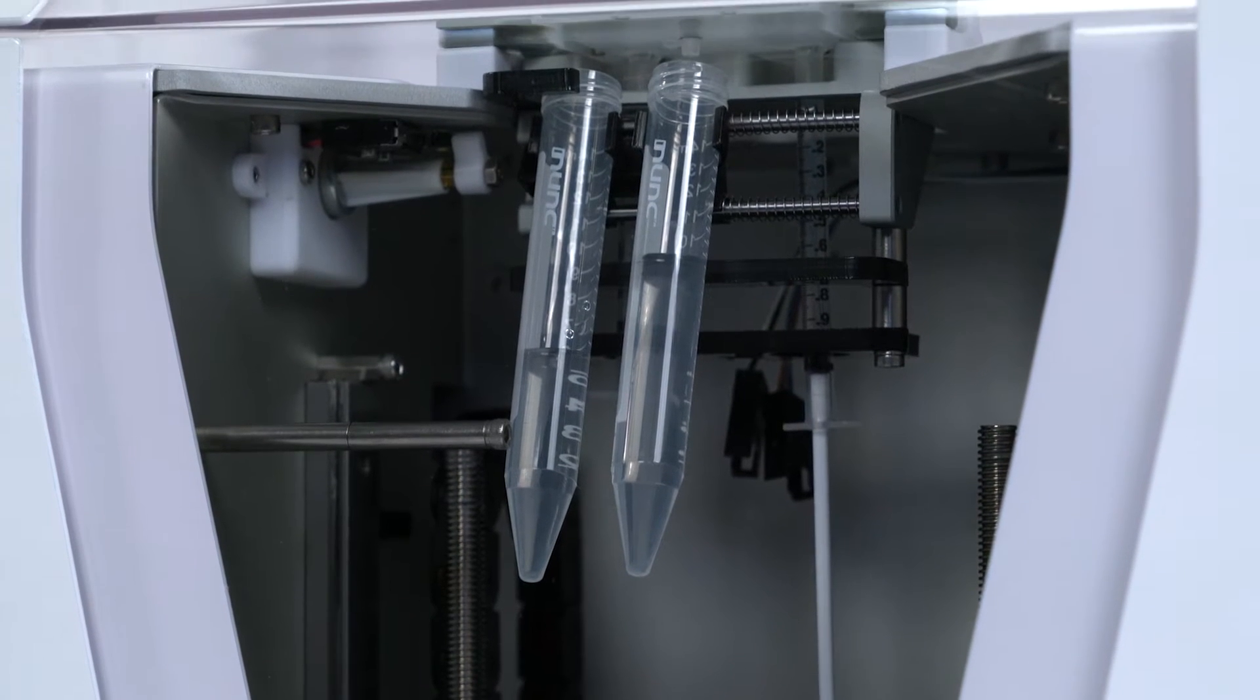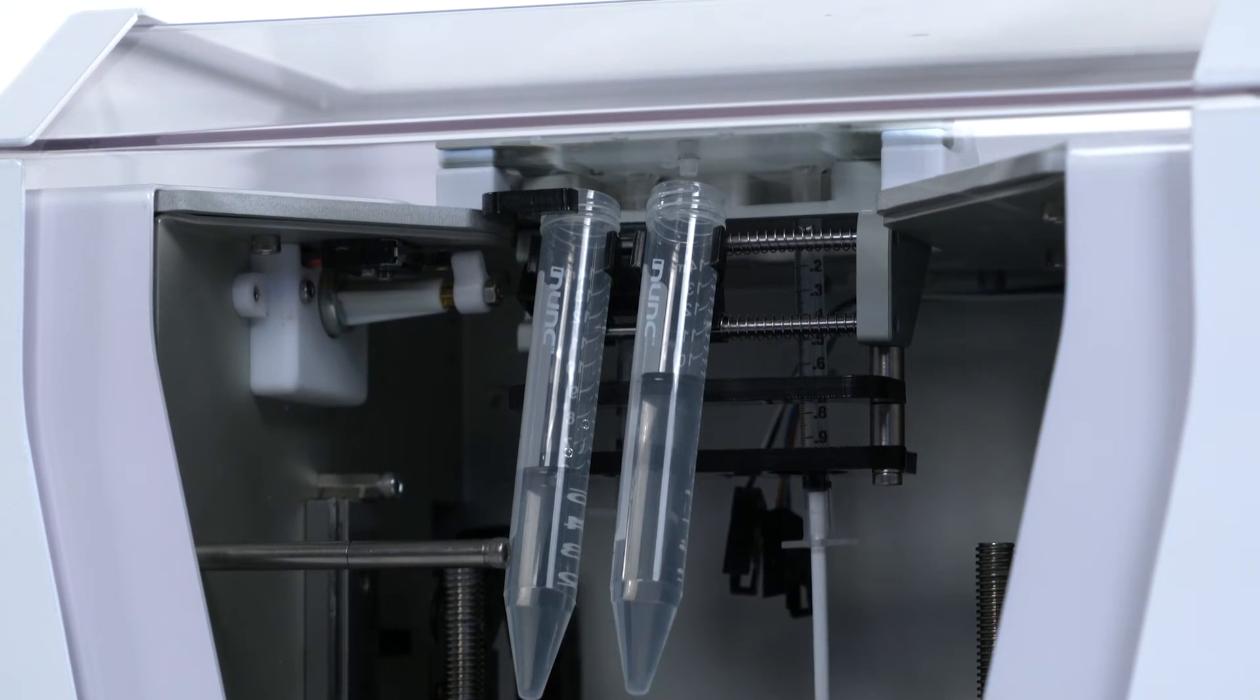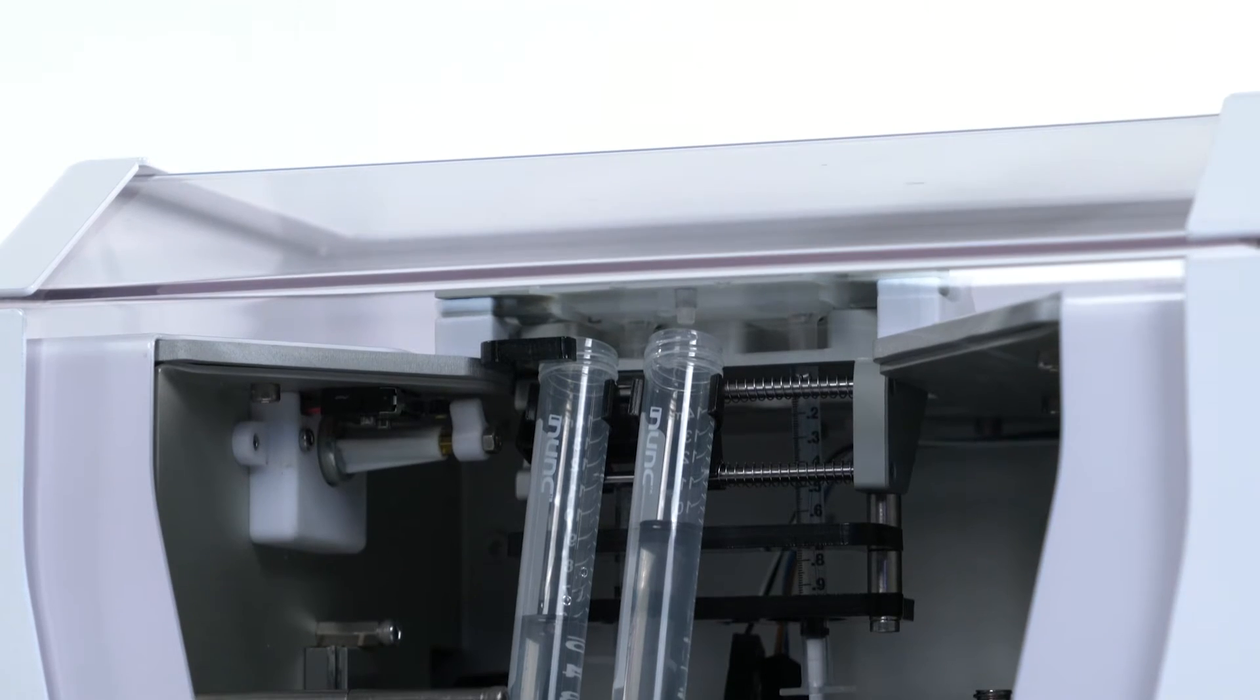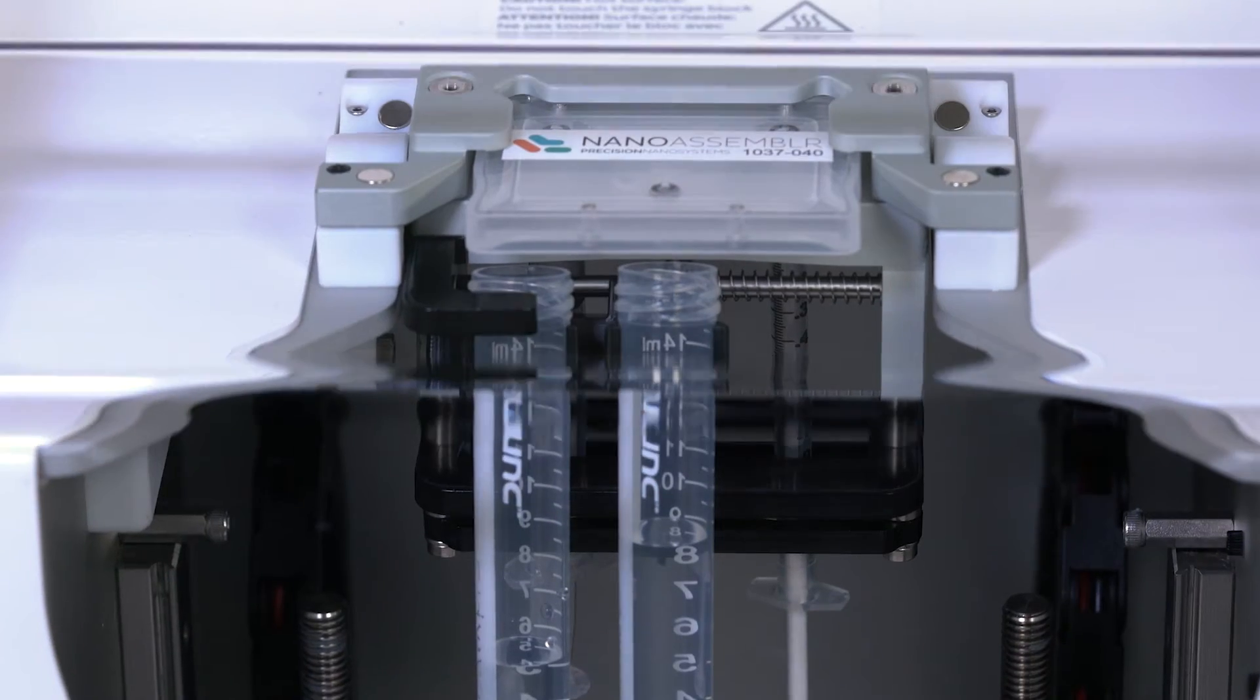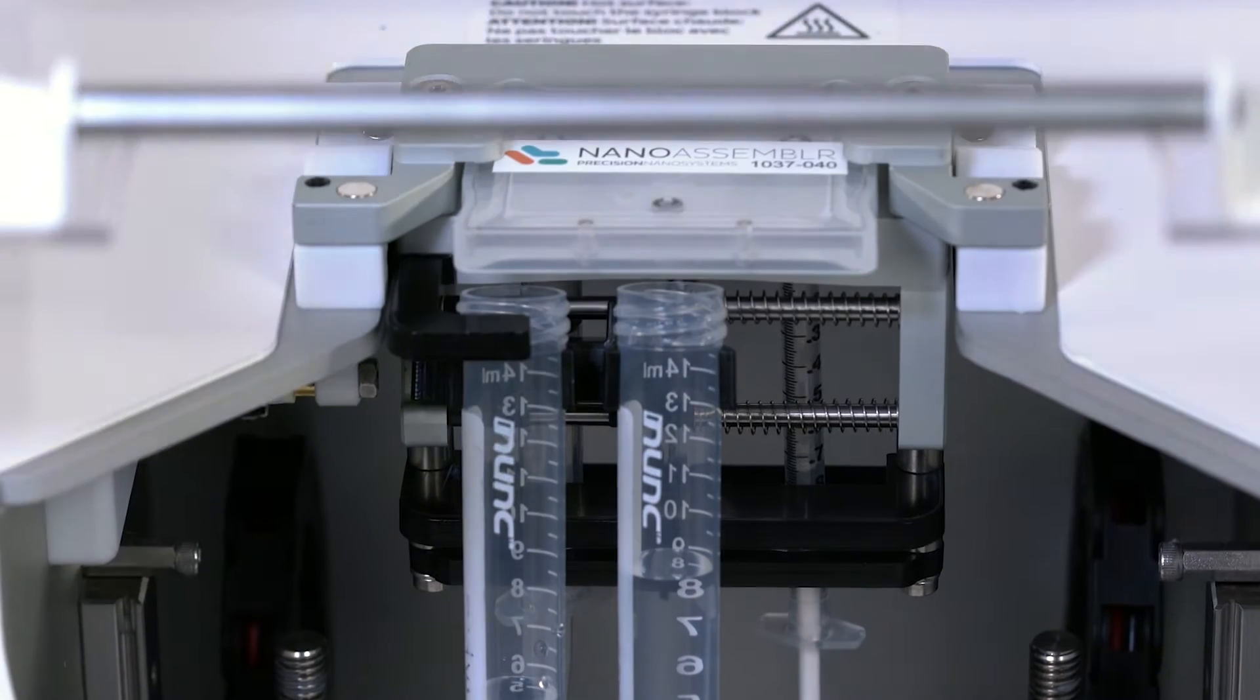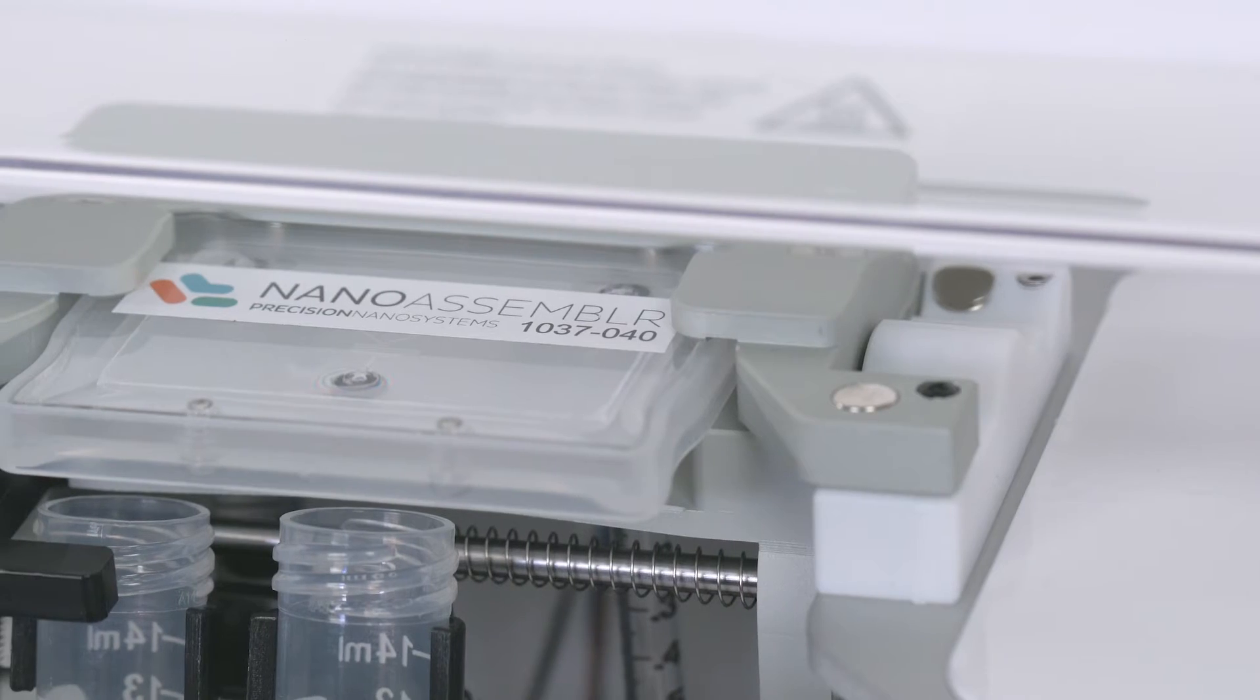The key thing with the Nano Assembler is all the complexity is contained within the microfluidic device. Suddenly you take out the art and it's purely a science integrated into an instrument with automated software. The barrier to entry for people to enter into the field of nanomedicines is dramatically reduced.